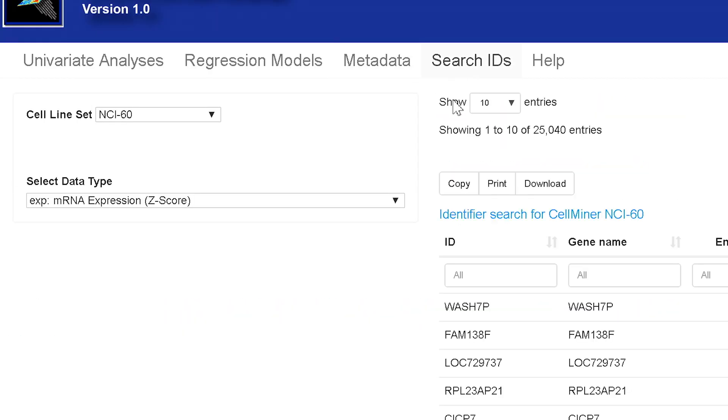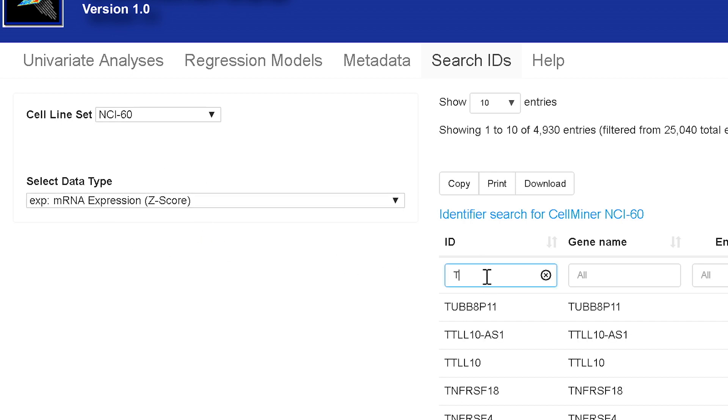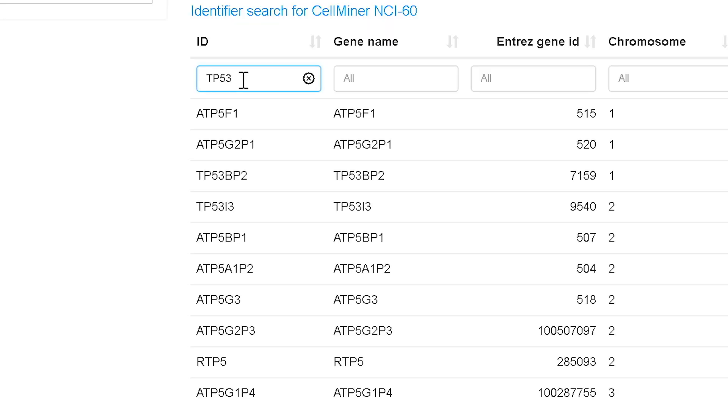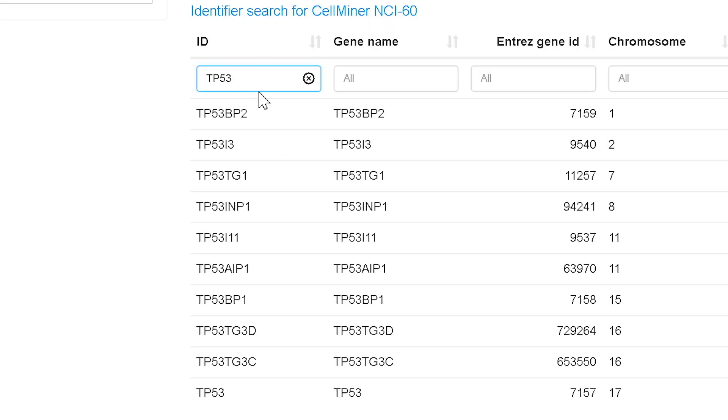The Search IDs tab allows one to search for the available identifiers for any dataset. In this example where I'm looking at expression data and the gene name, I can put in the famous TP53, and you see all the genes with TP53 in its name are brought up.